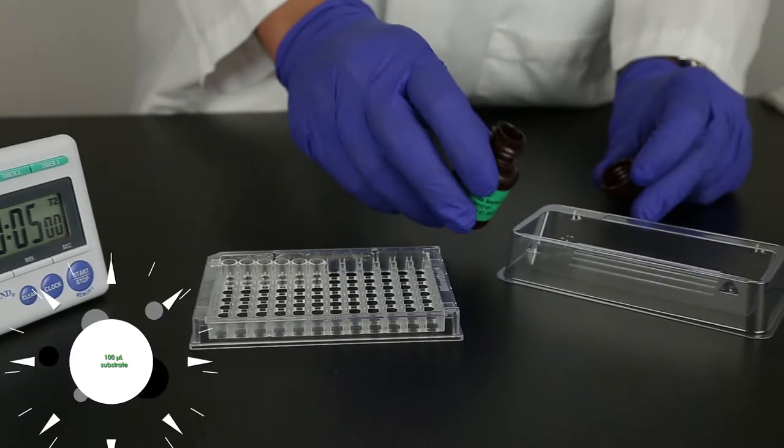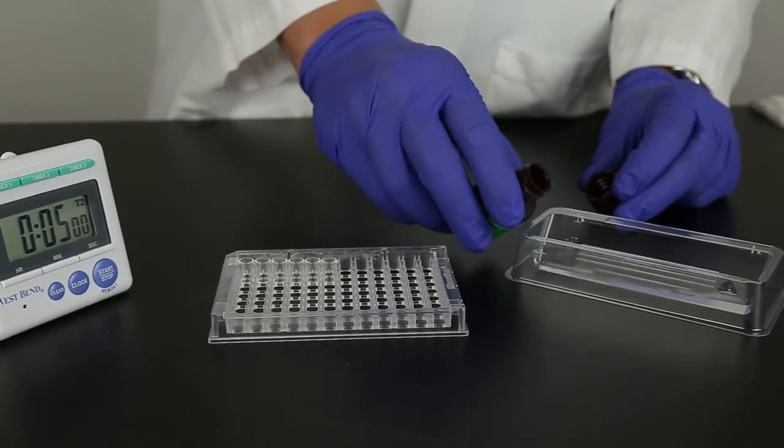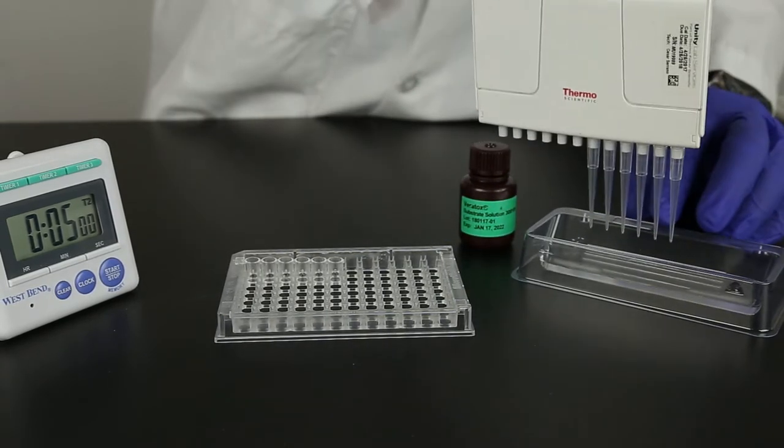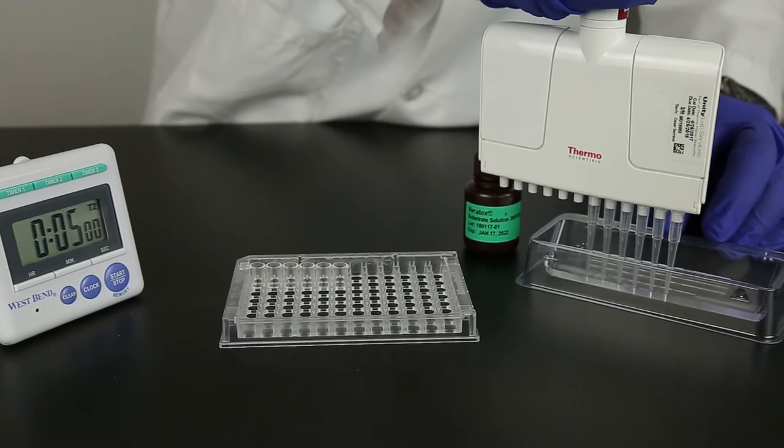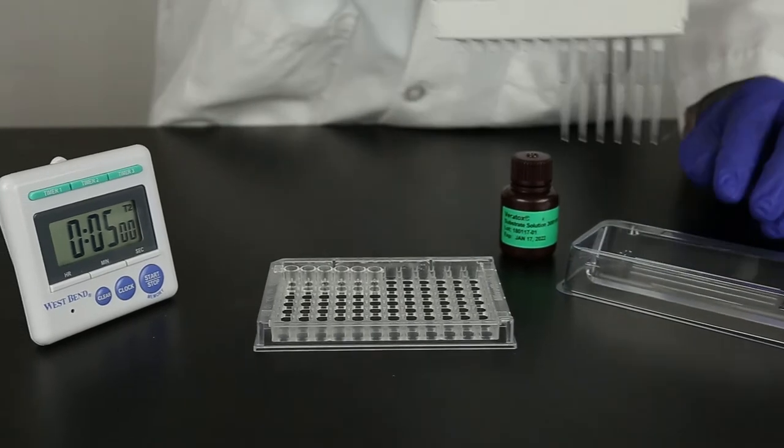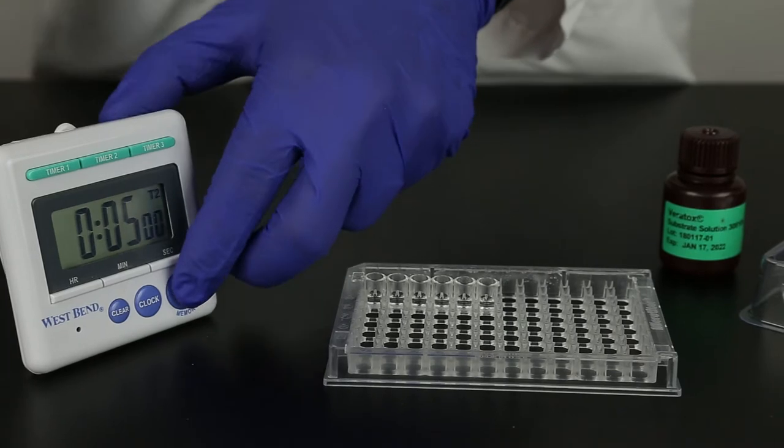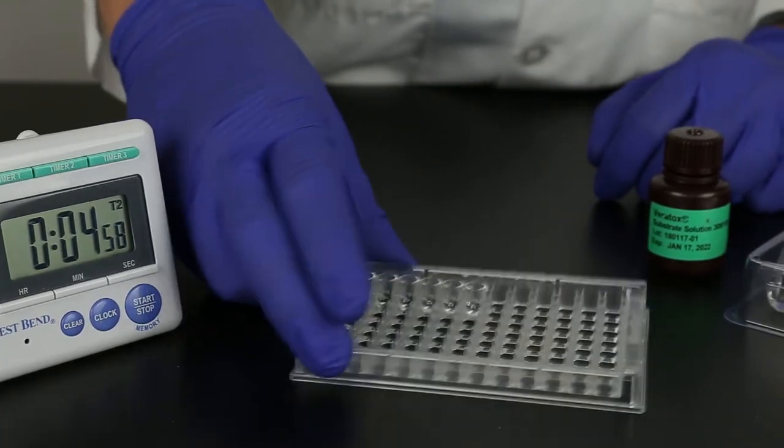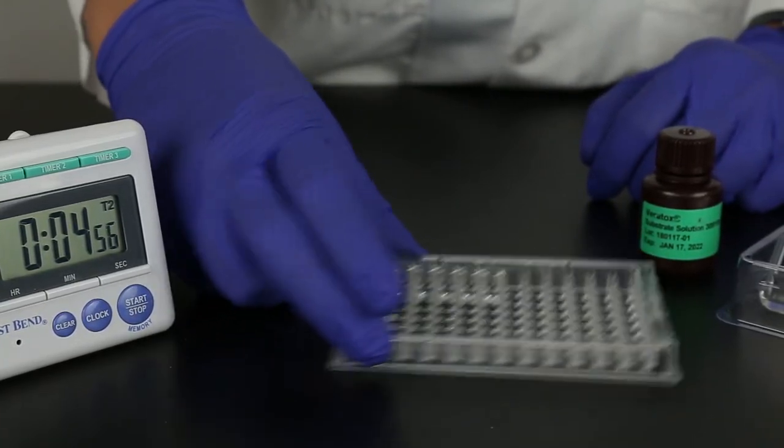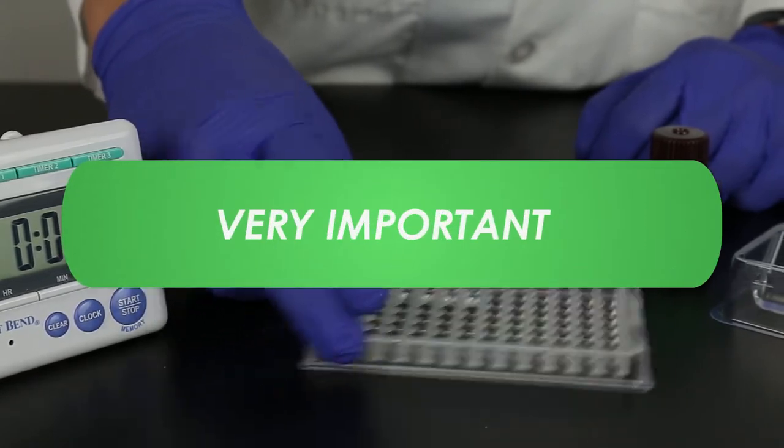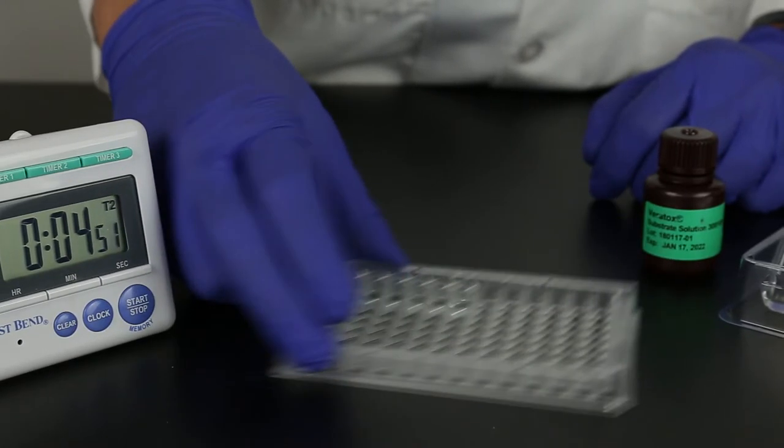Pour the needed volume of substrate from the green labeled bottle into a clean reagent boat. Using new tips on the 12 channel pipetter, prime and pipette 100 microliters of substrate into the clear microwells. Start a timer set for five minutes. During the first 30 seconds of the room temperature incubation, it is very important that you mix the wells vigorously by sliding the microwell holder back and forth on a flat surface without splashing the reagents from the well.